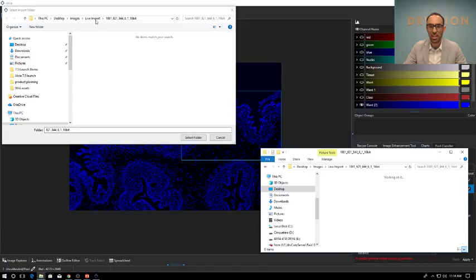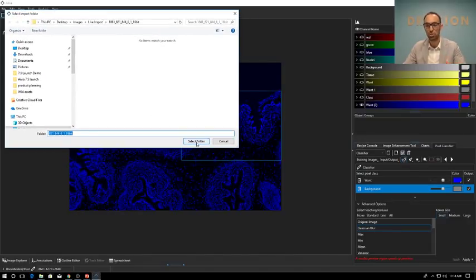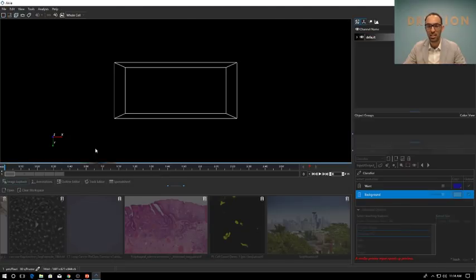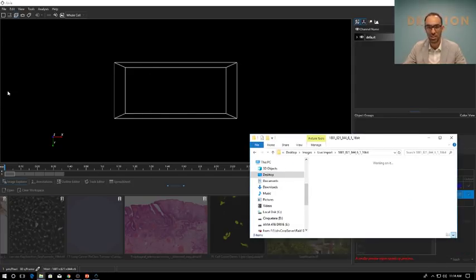So this folder right here is this folder here. So it's empty currently, it doesn't have anything. So I'm pointing right now, I'm saying, hey, Aivia, look at this folder, keep looking at this folder. And what I'm going to do is add some files there. So you see the folder is here, it's empty, Aivia is on standby. And now I would go onto my microscope and say, okay, start acquiring.